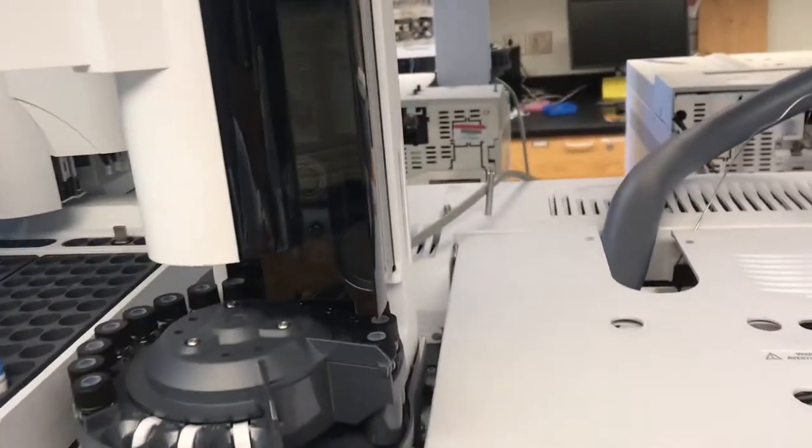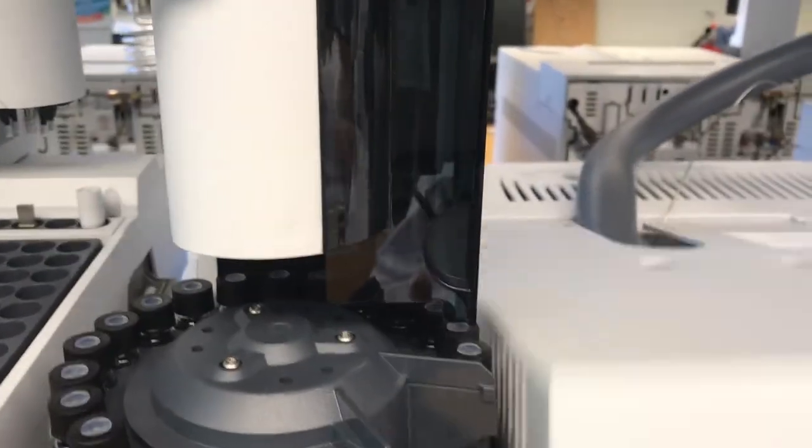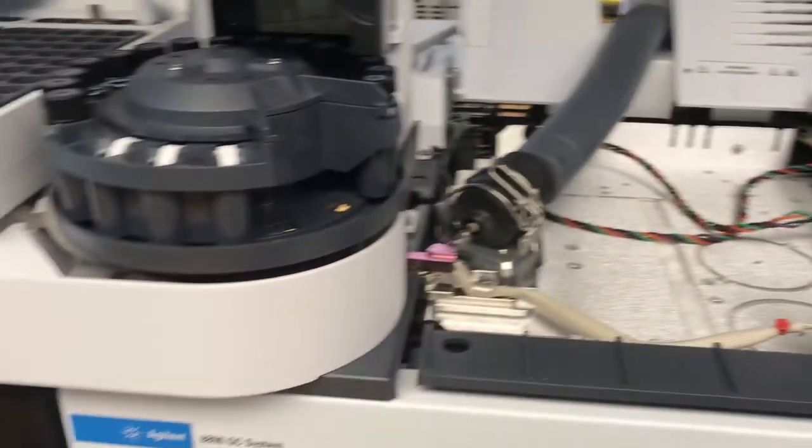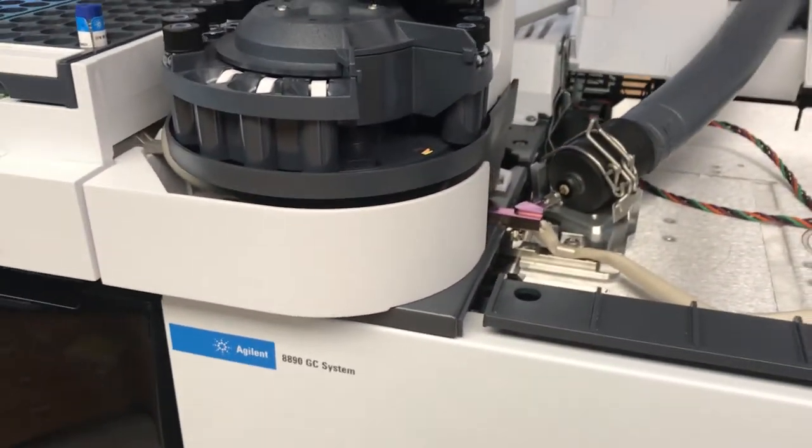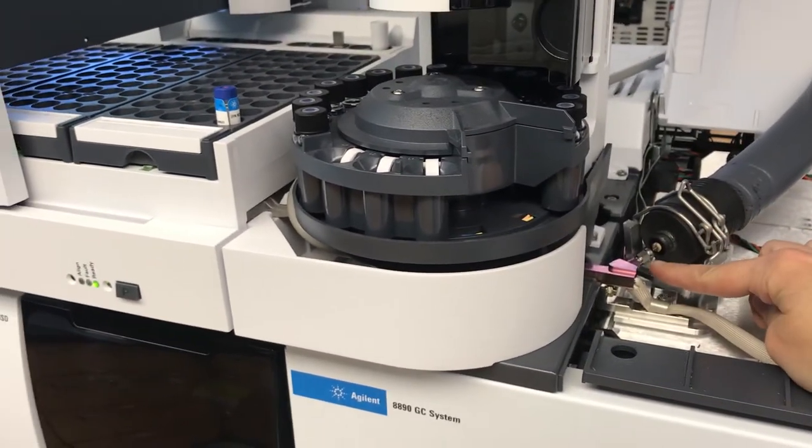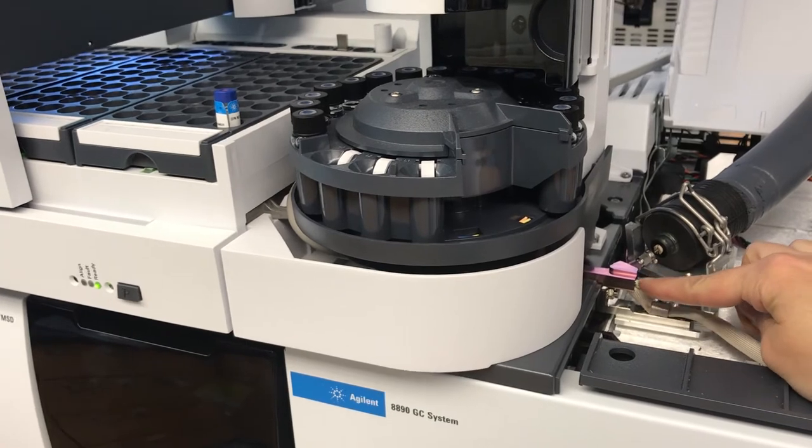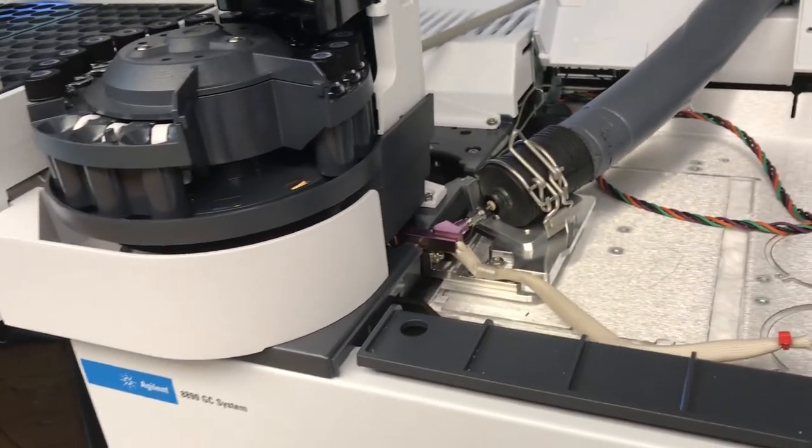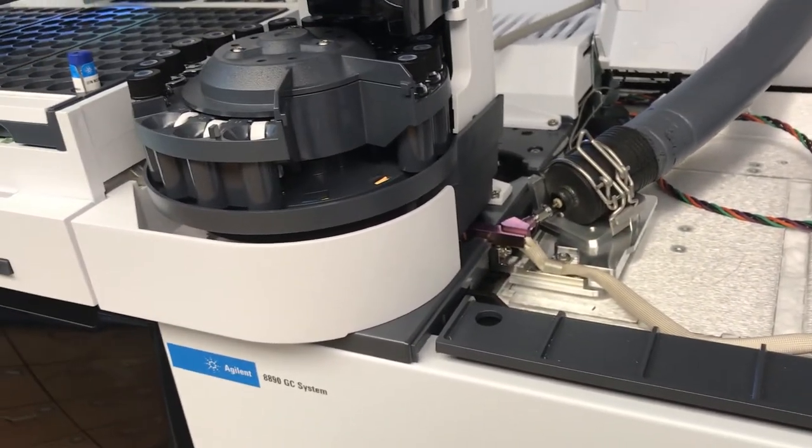And so we open up the top here. You can see that the transfer line connects into the inlet port. You can kind of tell it's going in there.